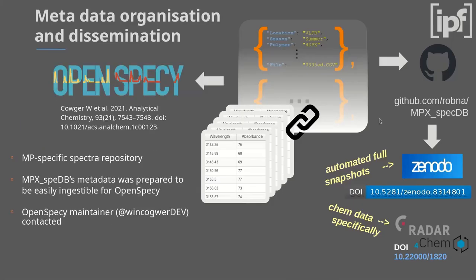There is also a repository for microplastic spectroscopic data. It's probably not known outside the microplastic community, but I contacted the developers of this, and they were happy about this project and said they want to include our spectral collection there. So yeah, this is also good.